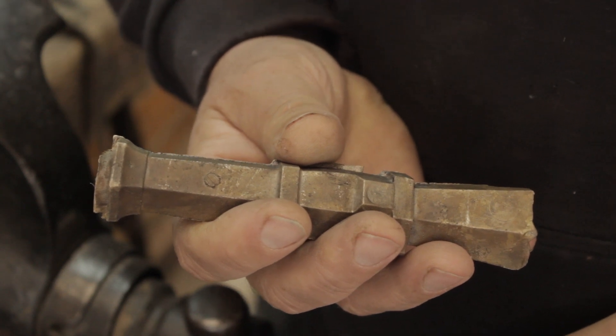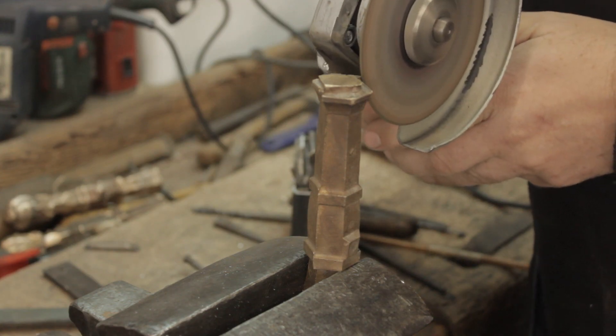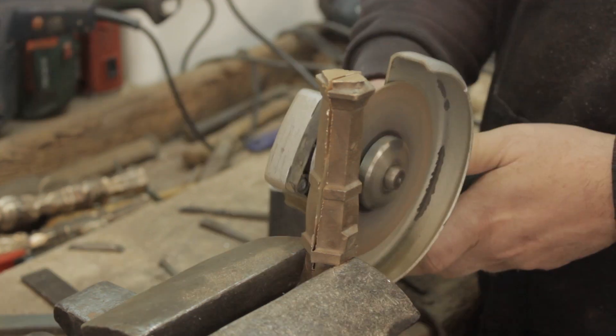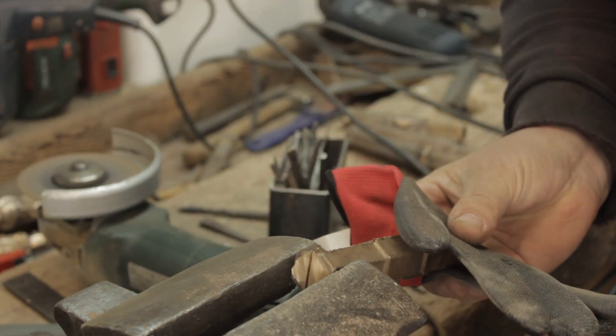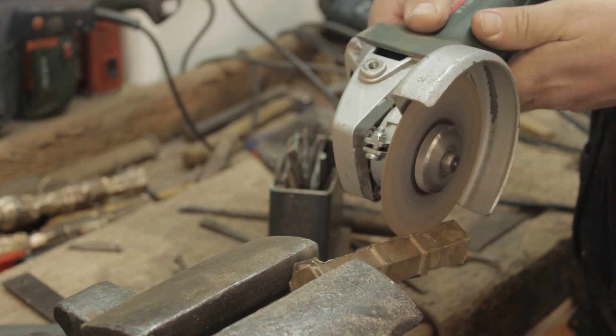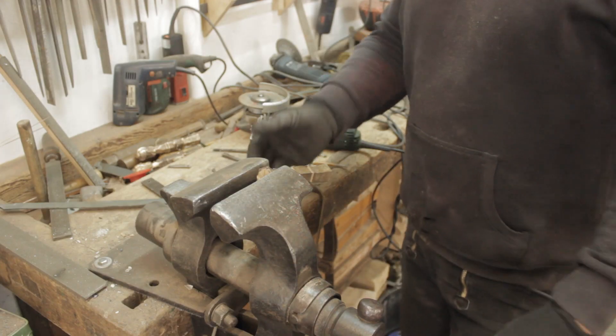Hello and welcome to another video of Archaeometallurgie.de. Today is all about examining a cast handgun. I'm going to cut one of these handguns in two parts down the middle, grind, polish and etch that section, and then examine it under the metallographic microscope. This is an introduction into metallography of bronze cast things - just a glimpse. I'll introduce a few basic terms and should you be interested, I'll probably make more videos about it.